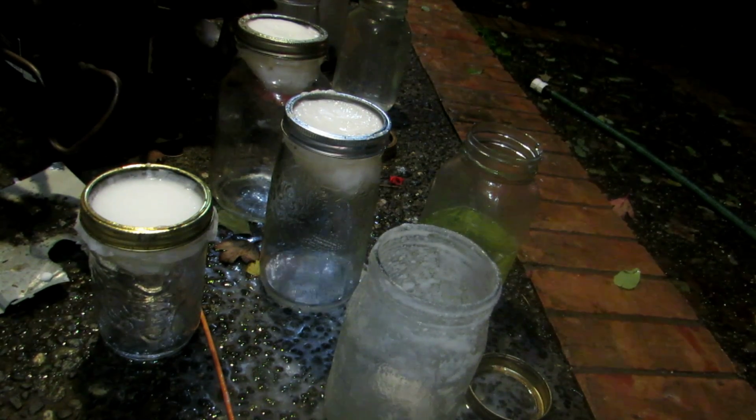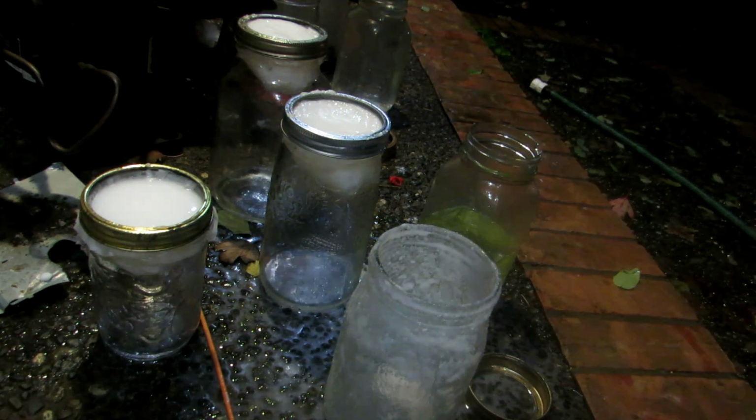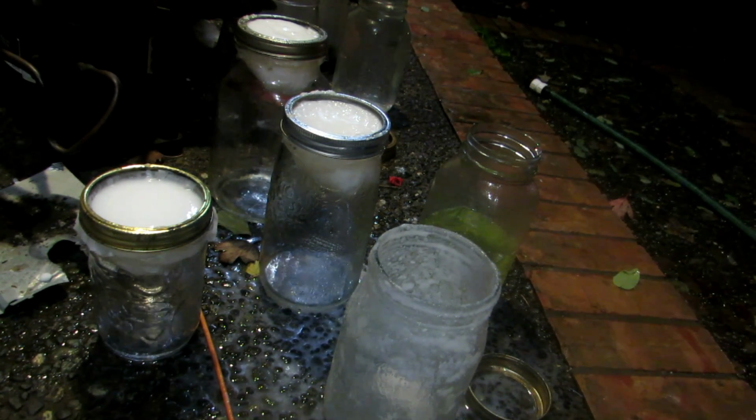Okay, so I just thought of this, but I started filtering, of course, to filter off all of our silicic acid. Now, sodium bicarbonate neutralizes most acids, and I'm not totally sure about silicic acid, but we may have just neutralized our silicic acid back into sodium silicate. I really hope that's not the scenario, but it may be, and we may have to repeat the step with hydrochloric acid. And anyhow, I'll figure out what happened in a moment.